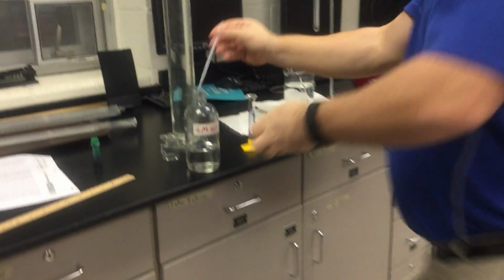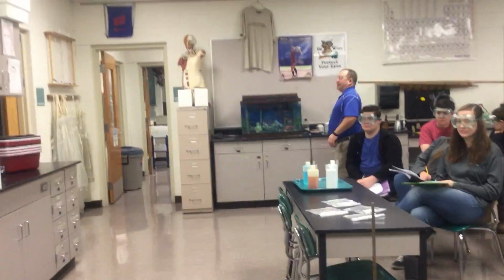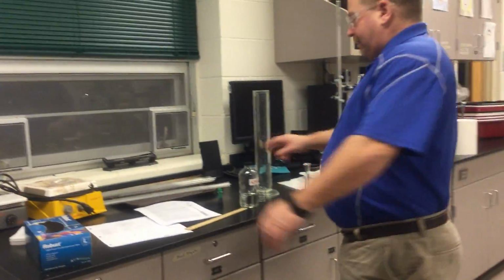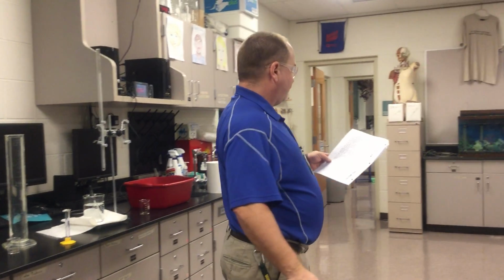All right, so now I have my 10 milliliters of 6 molar hydrochloric acid. Okay, once again, the caution says hydrochloric acid is corrosive to the skin and eyes. Avoid breathing the vapor. Make certain you are wearing goggles. If any acid should splash on you, well, I didn't, but let the teacher know.